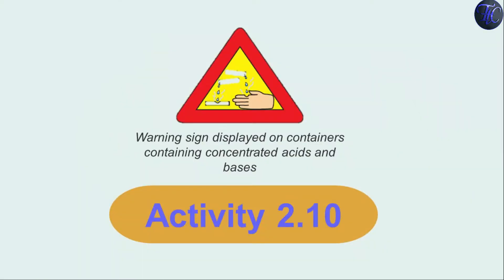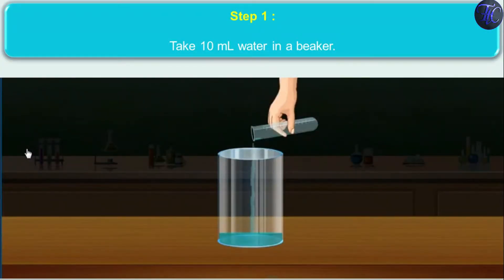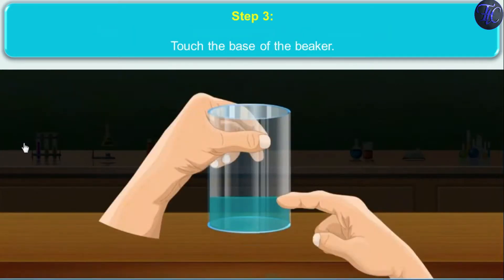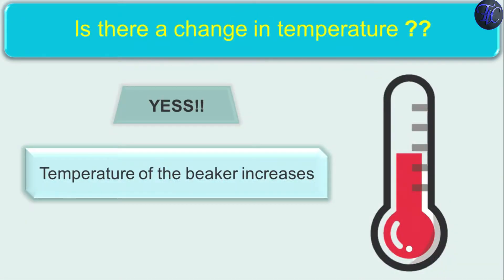Step 1: Take 10 ml of water in a beaker. Step 2: Add a few drops of concentrated H₂SO₄ and swirl the beaker slowly — caution must be taken while adding concentrated H₂SO₄. Step 3: Touch the base of the beaker — is there any change in temperature? Yes, the temperature of the beaker increases.